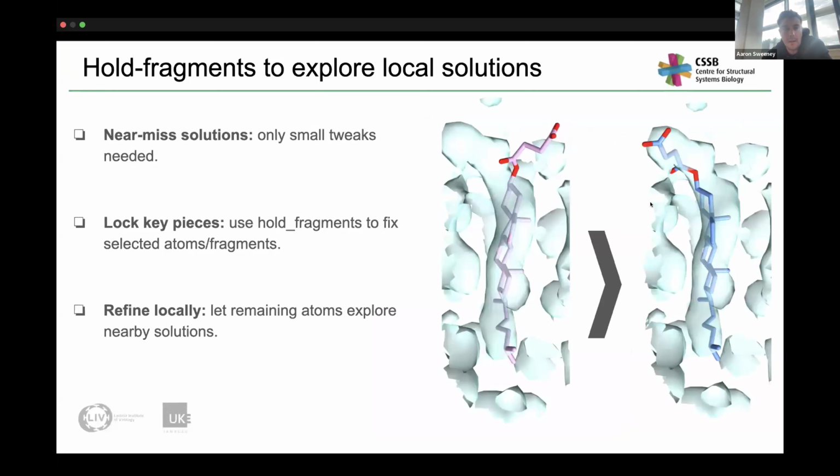Now, after this, I reran the MD refinement step, and the misfit region of the molecule has now moved into density that it should have been in anyway. This clearly still needs some slight refinement. However, it was late when I did this, and I wanted to go to bed.